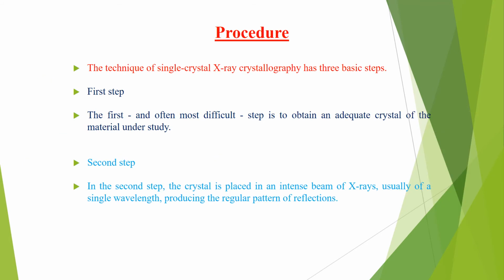Dear student, now we are going to discuss the procedure of single crystal X-ray crystallography. Here are three basic steps. The first step, and often the most difficult step, is to obtain an adequate crystal of the material under study.